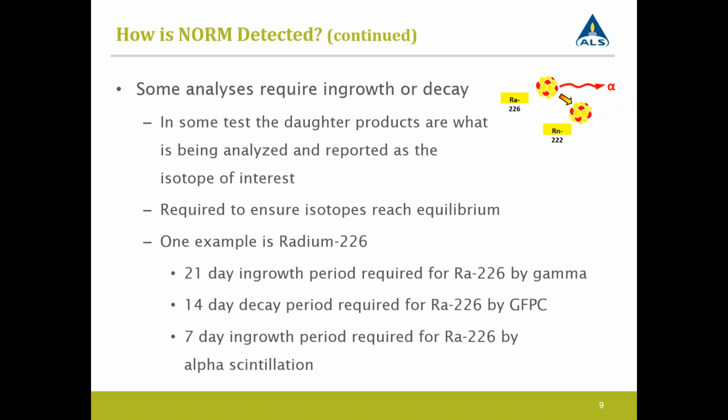So for a lot of these radioisotopes, because of these ingrowth and decay periods, and special preps and chemical separations, turnaround times are longer for radiochemical results than what you see in your standard stable chemistry analyses.